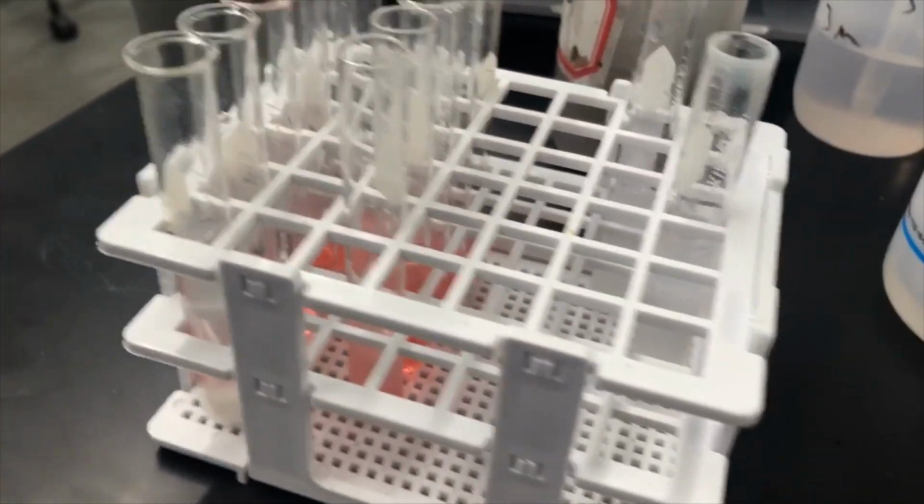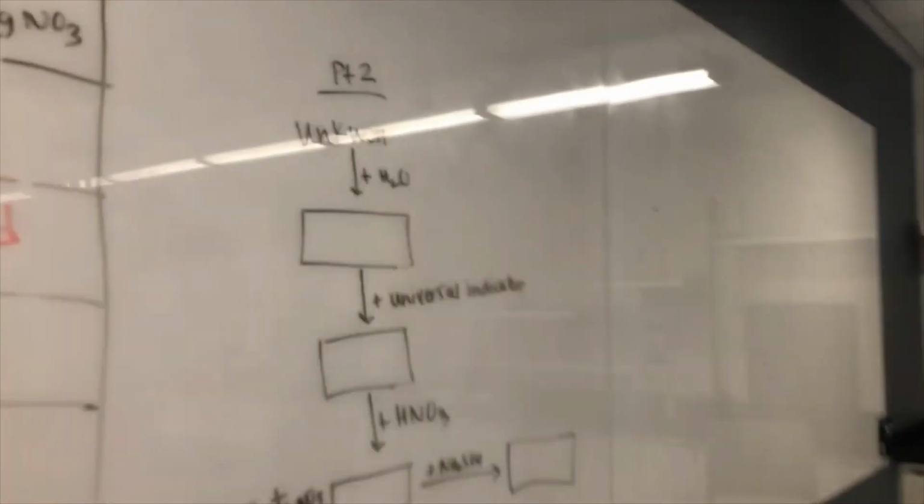For our unknown, we added water. It was soluble. So that tells me that both of the compounds we're using are soluble compounds, or at least slightly soluble. Now, let's move on to the second part.